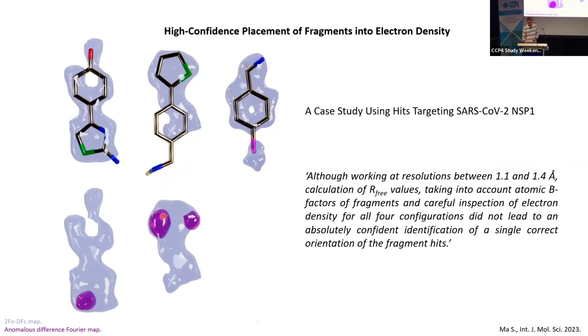So basically it's in a double conformation. And now this one is quite interesting because I would have fitted exactly this fragment in this way. At the top, it might be difficult to see, but there's a carbon, an amine, and below a methyl group. So quite strong in density. And here, just a chlorine.